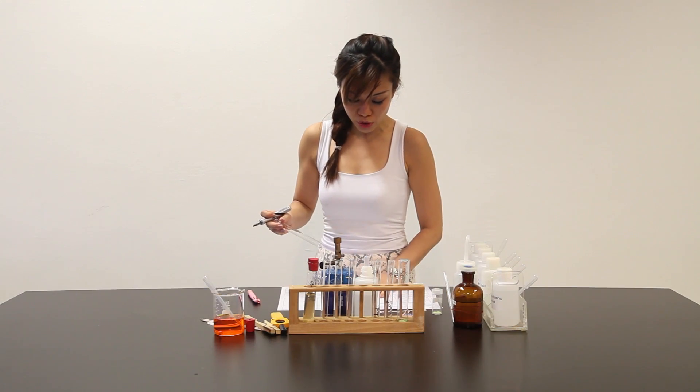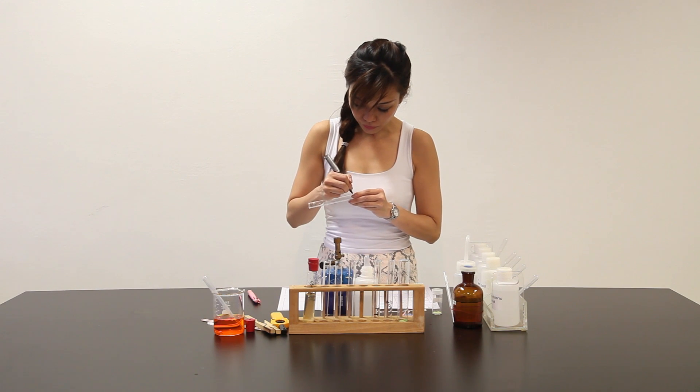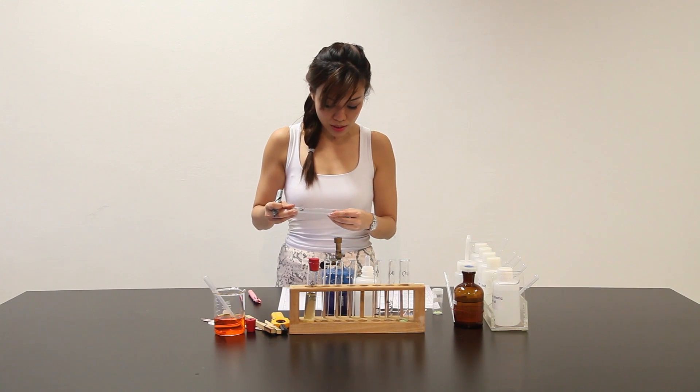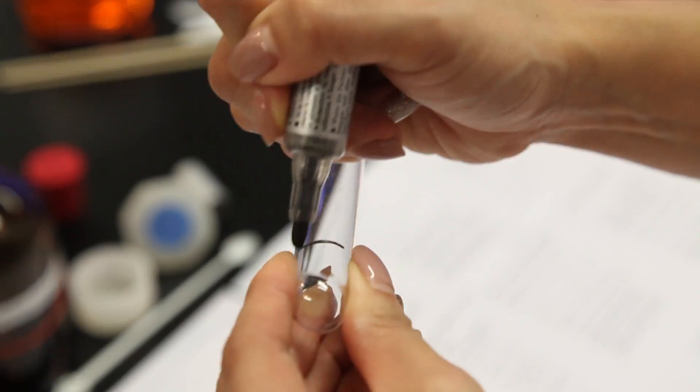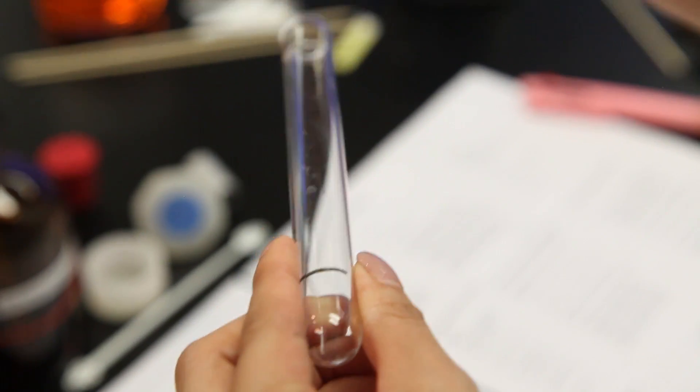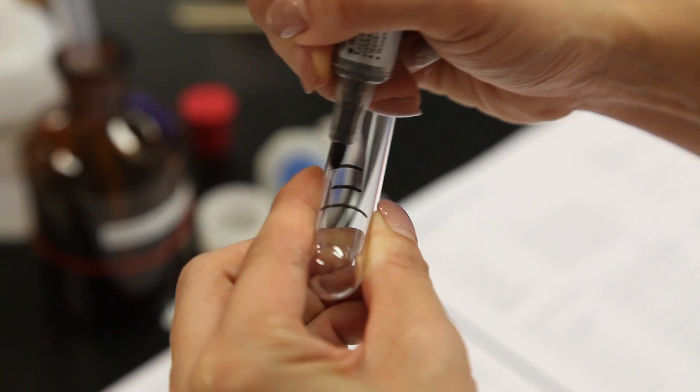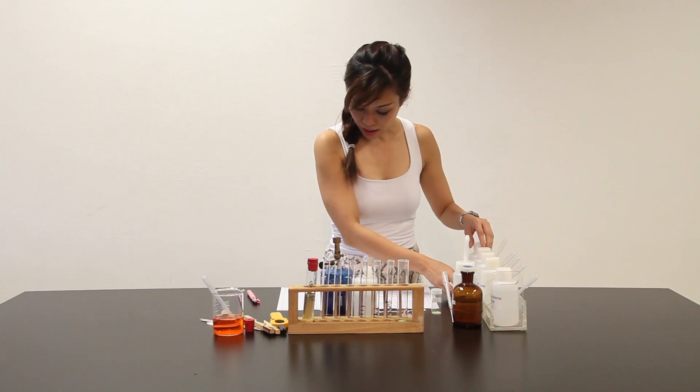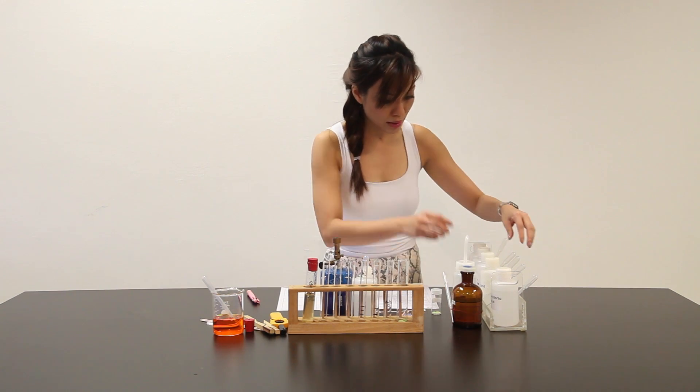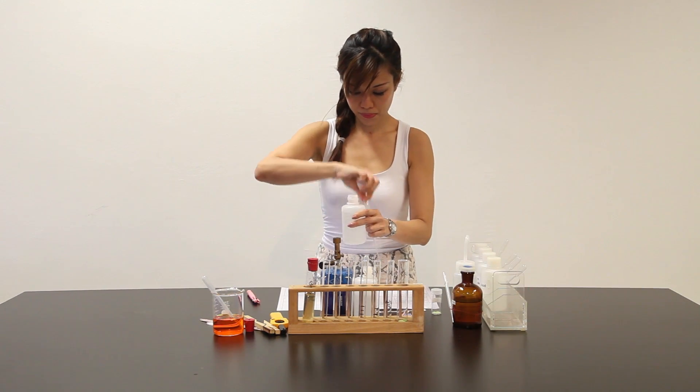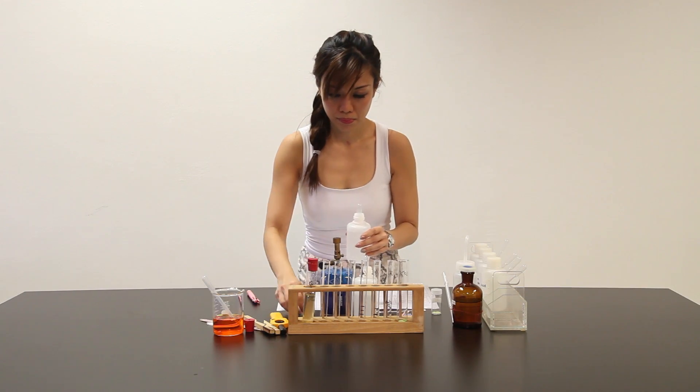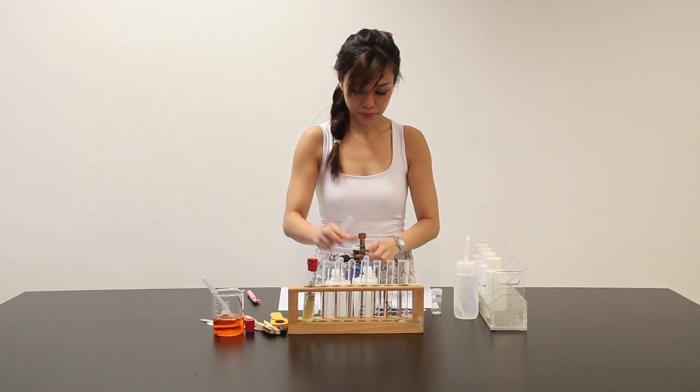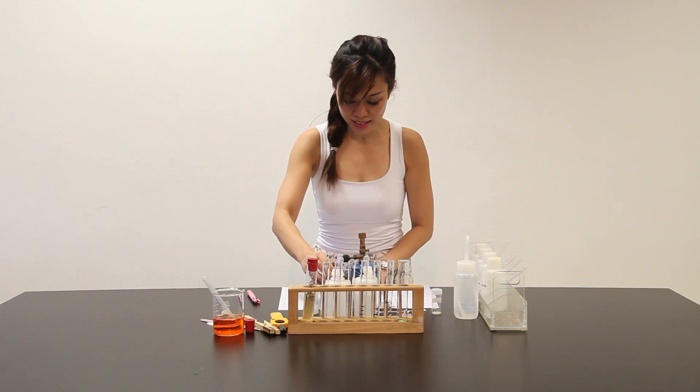Part D says that place about 2 cm3 of Q into a clean test tube. And to this solution, add another 1 cm3 of dilute hydrochloric acid followed by another 1 cm3 of barium chloride. So let me put this here. I need to add dilute hydrochloric acid and barium chloride which is here. So everything is set up.